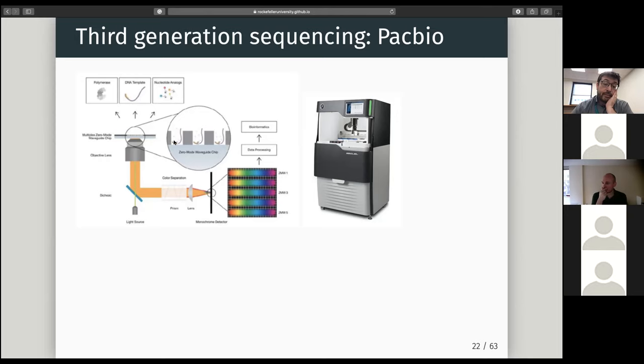It's done differently from Illumina, because PacBio doesn't have cycles. Essentially you're going to sequence at the speed of the polymerase. So you're taking movies. What happens is you have all this dyed nucleotide floating around at pretty high speed. Your camera doesn't see it, right? But as soon as a nucleotide is incorporated by the polymerase into the sequence, it pauses for a small amount of time. That is enough to be visible on the camera. And then the dye clears and it keeps going like that.